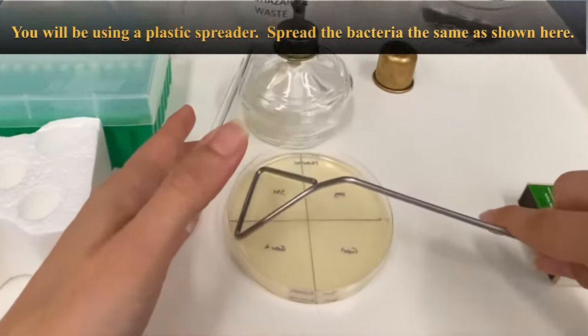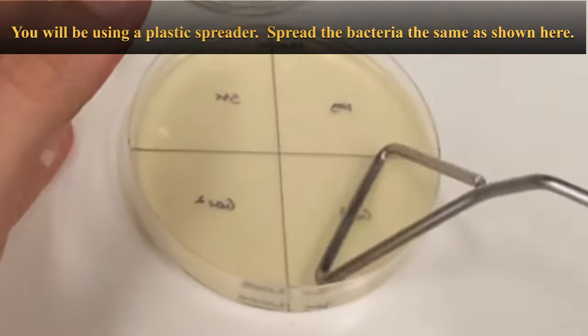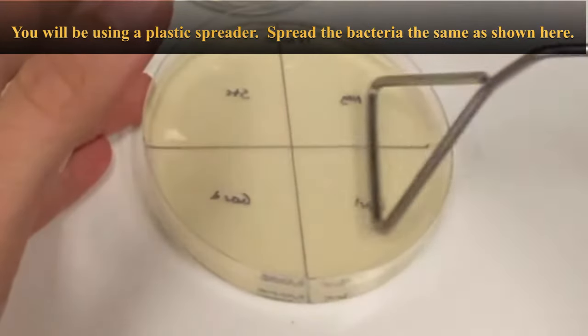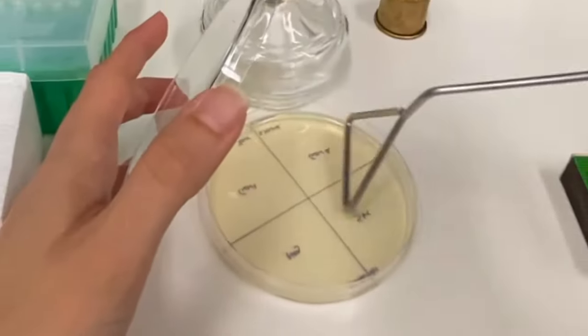To spread your bacteria, lift the plate lid and allow the metal spreader to just touch the surface of the agar. Spread the bacteria suspension evenly over the entire surface.